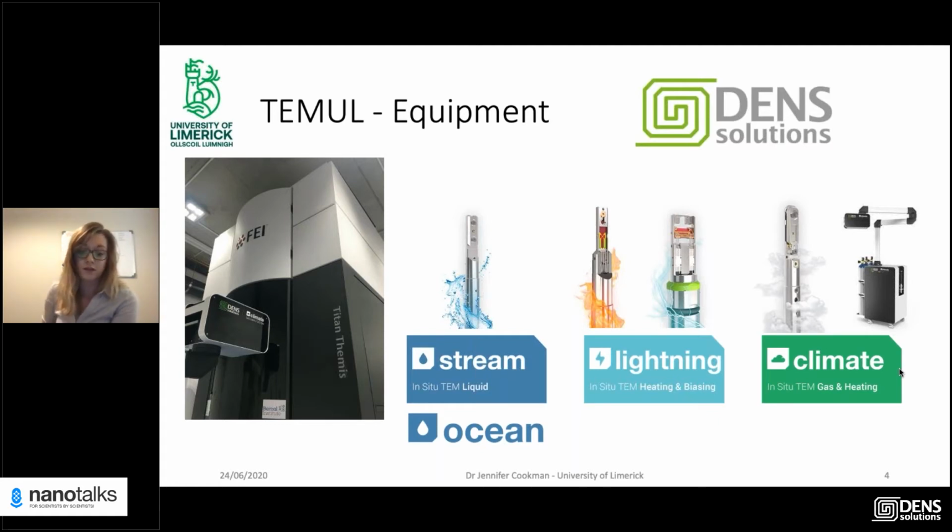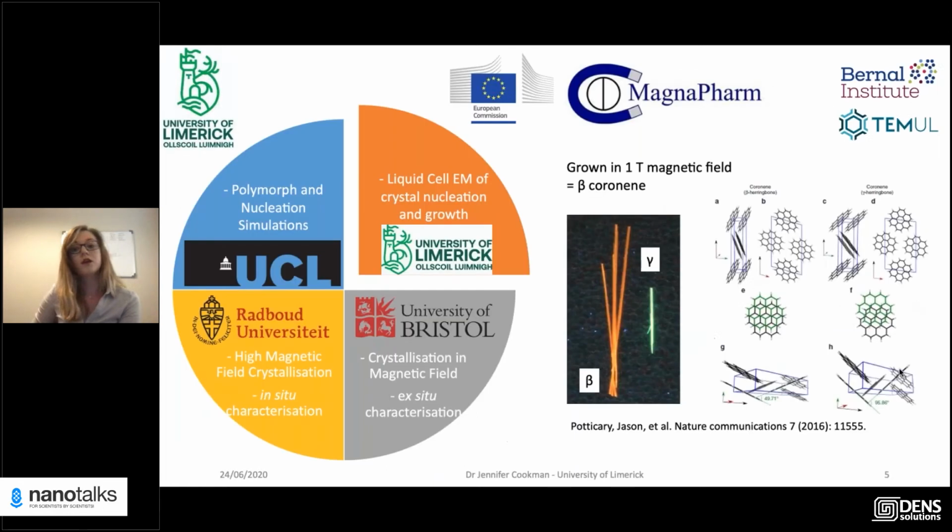So it's these kind of holders that really give us the access to do very specialized experiments in native environments and environmental conditions. So as Olaf was describing to you, I'm a postdoctoral researcher in University of Limerick, and the reason why I'm there is to partake in a project called MagnaPharm, which is a FET Open European Commission funded project.